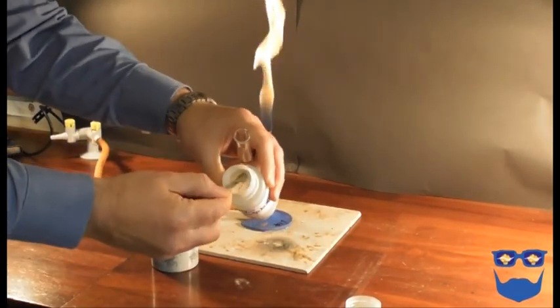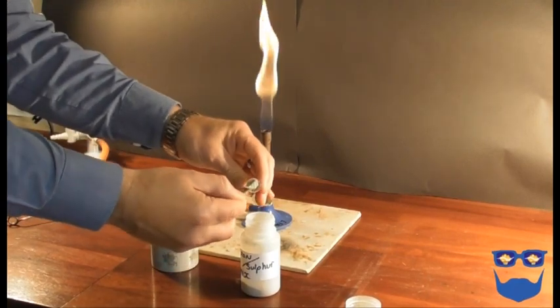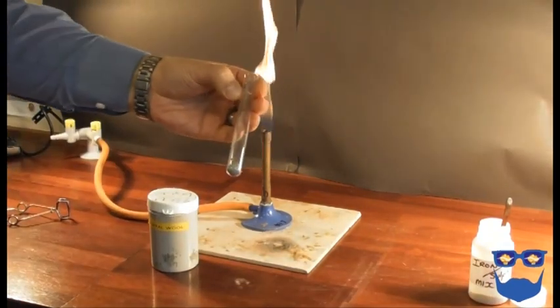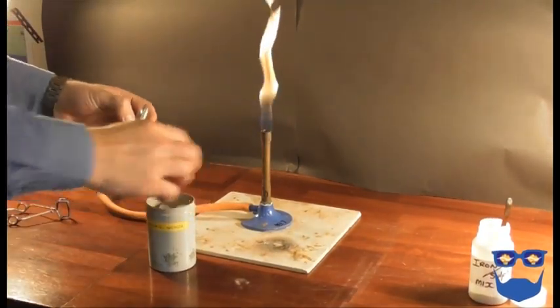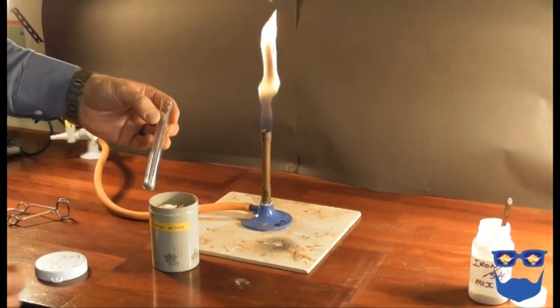Place a heaped spatula full of the mixture into your test tube. Using some mineral wool, fit it into the mouth of the tube. This is to prevent any sulfur vapor escaping.